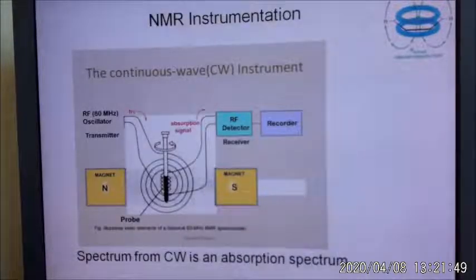Okay, so when NMR was originally developed, it was actually developed by physicists, and what happened was they were expecting just to see a single peak, and suddenly they found out they had numerous peaks. And so it didn't satisfy the criteria they needed for the experiment. It got handed over to the chemists, and the chemists saw it and said, oh, we can determine the environment around these different protons because we see these differences.